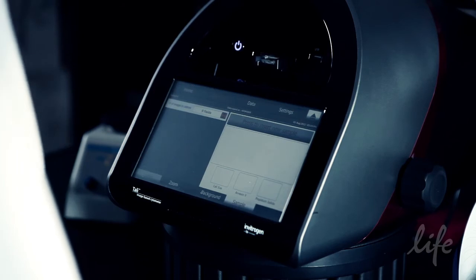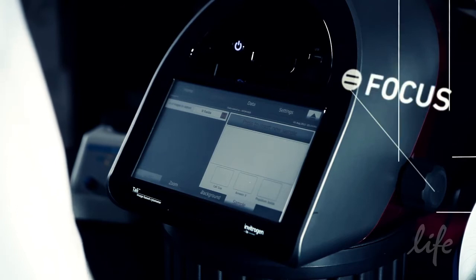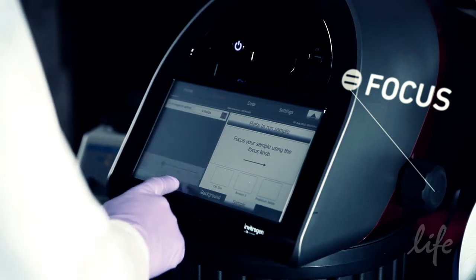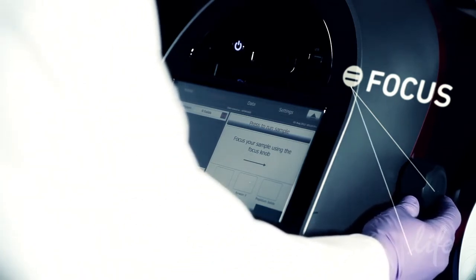Your sample will be drawn into the instrument and you'll be shown a live view of your cells. When prompted, focus the cells using the image adjustment knob on the right side of the instrument. Correctly focused images have uniformly dark colored cells surrounded by bright halos.